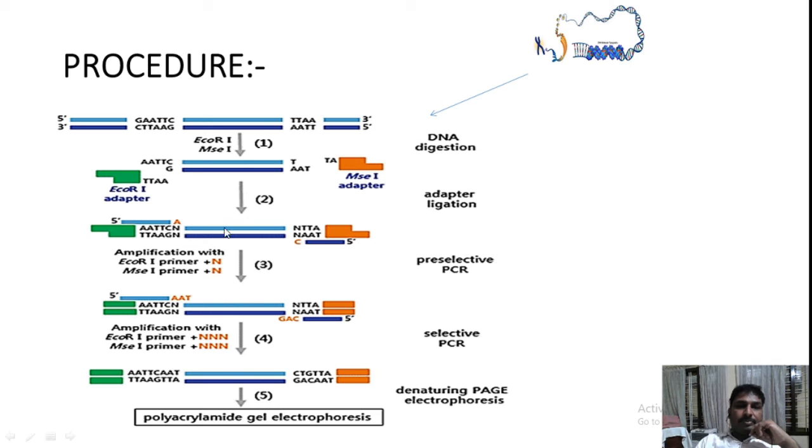That is, here is the genome. Exactly the same thing. This had been digested with restriction enzymes. Don't think about this, okay? Then you will get so many fragments. And next, you had added adapters.